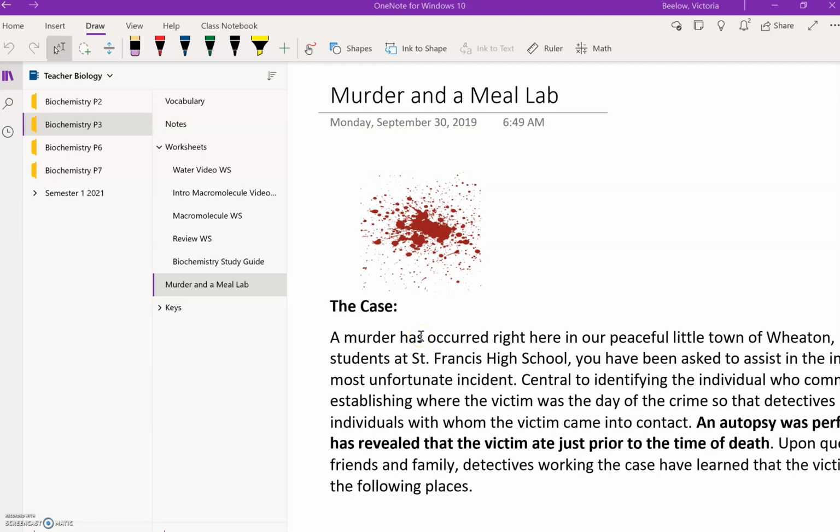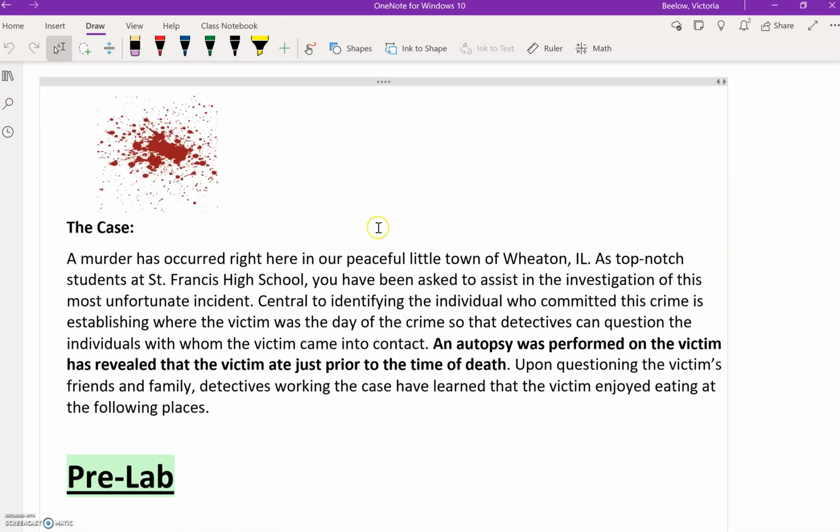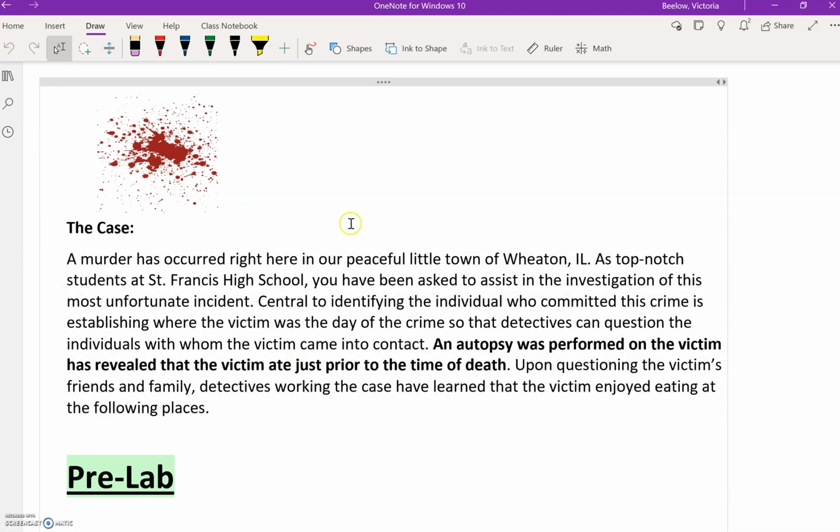Mrs. Belo here. In this video, I'm going to be going over the murder and a meal lab in our biochemistry unit. You can read what the lab is about more in detail right here, but essentially there was a murder here in Wheaton, in our little town, and we have to solve for where the victim last ate their meal prior to death. And we're going to be using our knowledge of macromolecules to figure this out.